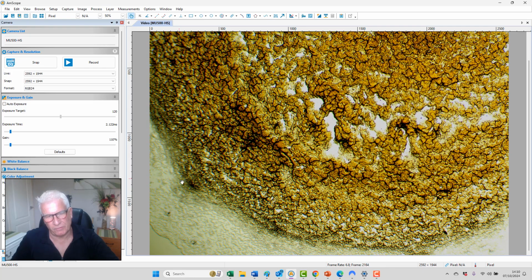Oh, you can see around the edges too, you can see how these cells have streamed across the glass a little bit. Low vitamin C. Either low vitamin C, meaning we're not taking in vitamin C. Vitamin C is the glue that holds us together. That's why we expect to see these. This is what we call the double coast. This is the edge, but the cells have streamed across the glass a little bit. So where's the glue? Where's the vitamin C? Doesn't mean you're not taking vitamin C, because you may have a cell membrane imbalance, a catabolic cell membrane imbalance. And when you have a catabolic cell membrane imbalance, your body doesn't use much vitamin C because it's more breaking down than building up. Vitamin C is about building up connective tissue.